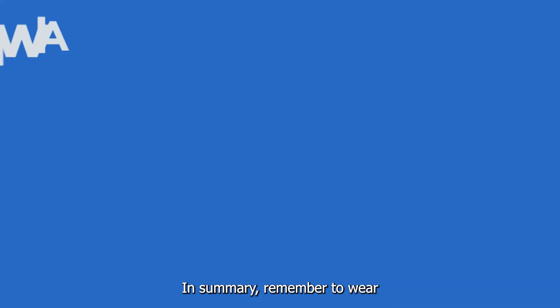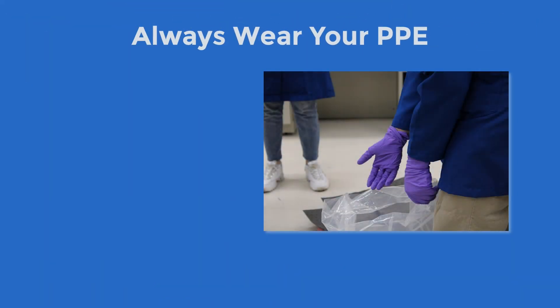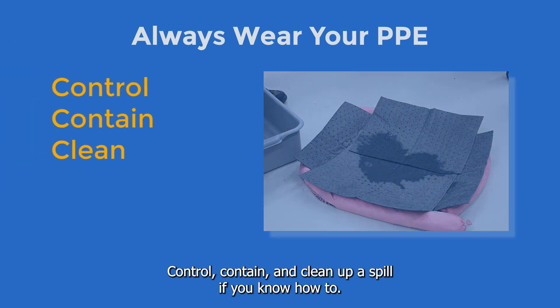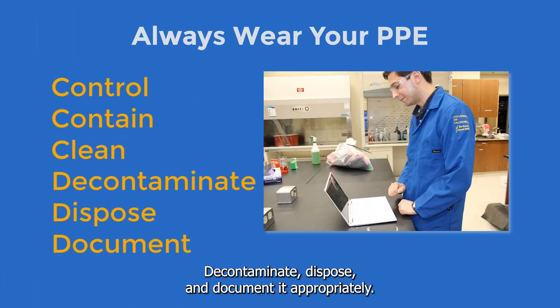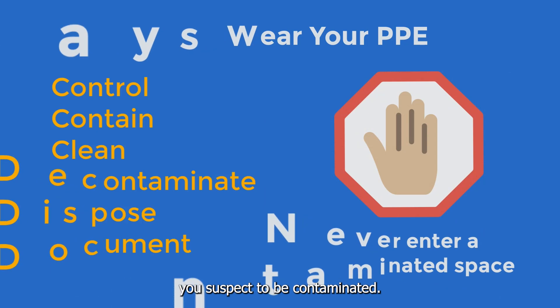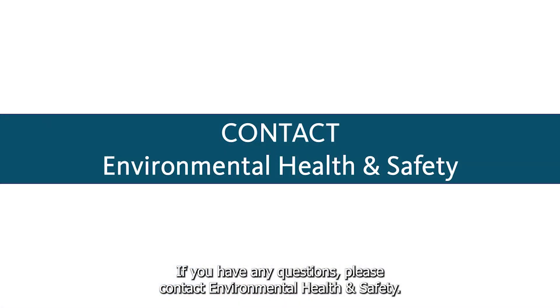In summary, remember to wear appropriate PPE at all times when working with hazardous materials. Control, contain, and clean up a spill if you know how to. Decontaminate, dispose, and document it appropriately. And remember, never enter a space you suspect to be contaminated. If you have any questions, please contact Environmental Health and Safety.